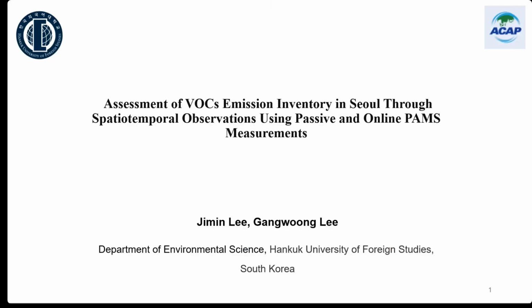Hello everyone, my name is Jinui from Hankuk University of Foreign Studies. I have conducted research on measuring and analyzing VOCs using the passive sampling method. In today's lecture, I will explain the passive sampling method for VOCs based on my experiment and research.